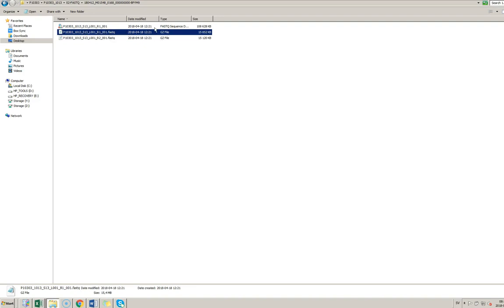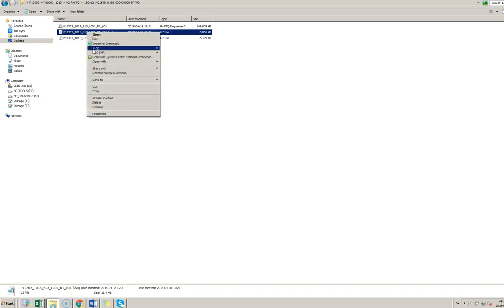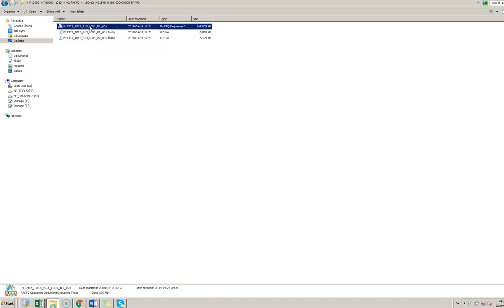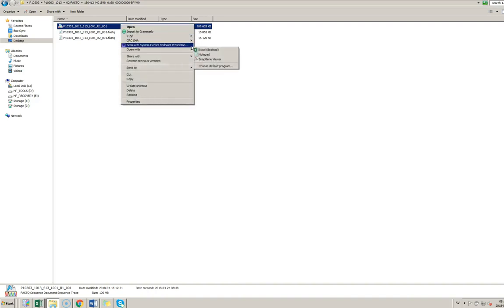These are FASTQ files containing the data and they're zipped as GZ files, so you just need to unzip them. I usually use a tool to unpack them, and you get an unpacked file which is much bigger. Then what I've done here is to open that file with Excel.